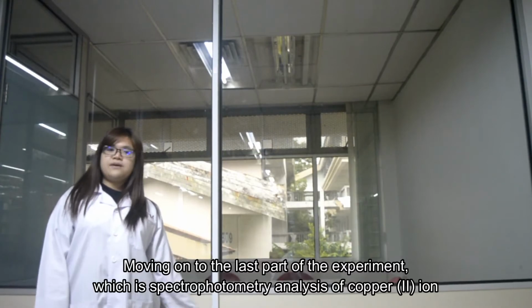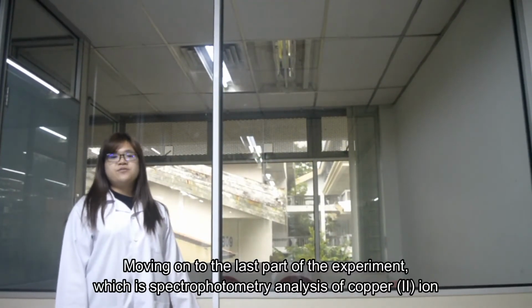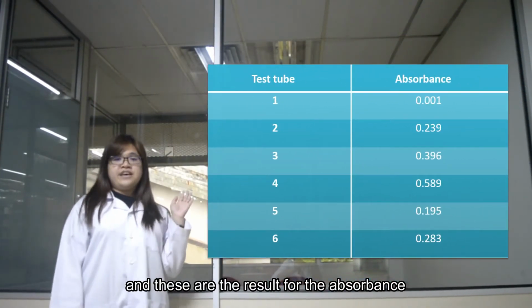Moving on to the last part of the experiment, which is spectrophotometric analysis of copper-2 ion, and these are the results for the absorbances.